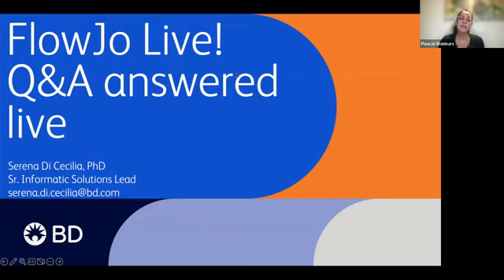Meanwhile, I can start with some of the questions that I received by email. There is a really frequent question, and it's also one that arrived: can I rename an FCS file? The short answer is, if you want to rename the actual FCS file within FlowJo, you can't. But there are several things you can do.